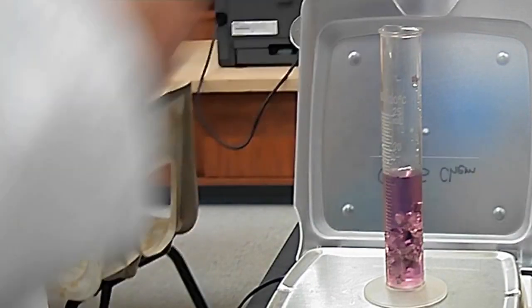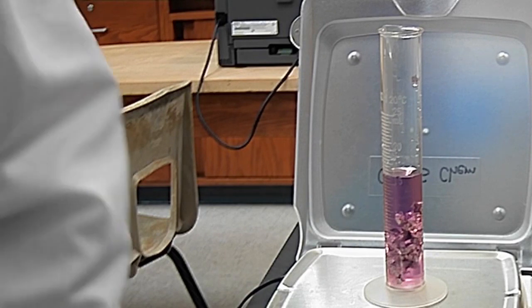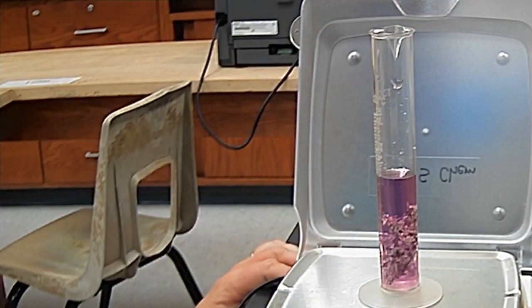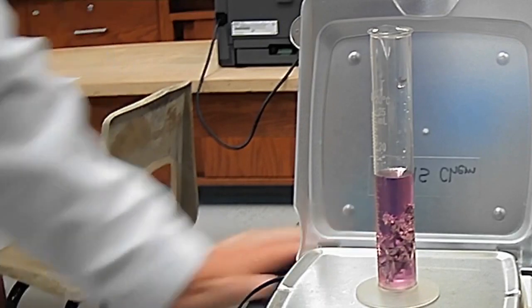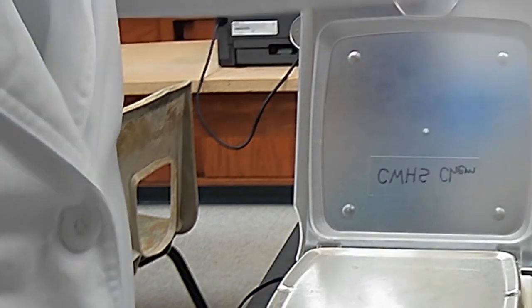Okay, our new mass is 30.4 grams. So for trial 3, metal B is 30.4. And our new volume is going to be, looks like 16 milliliters. So our new volume for trial 3, metal B is 16 milliliters.